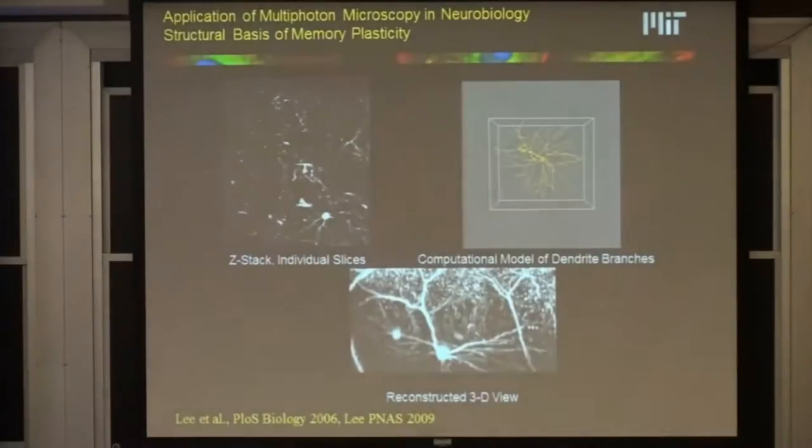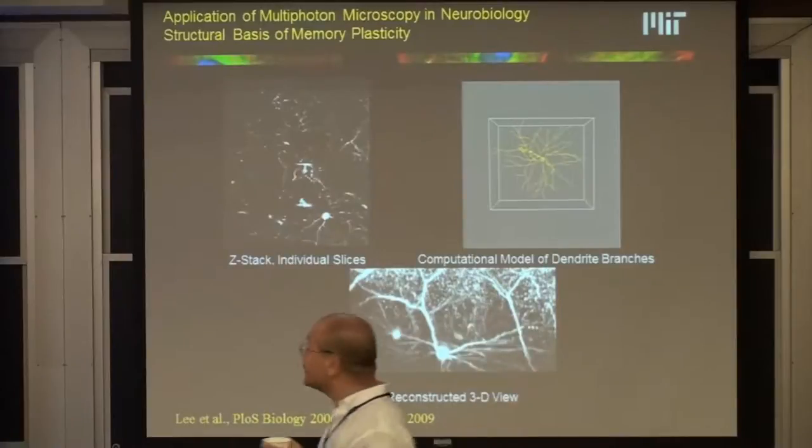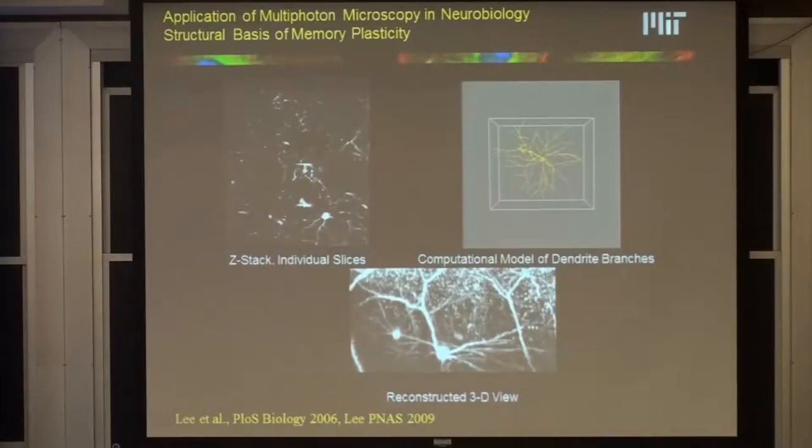Okay, so last image, so that I don't take up the panel's time, is if you take a look at what you can image with endogenous signal, that works pretty well. But I should point out that if endogenous signal works very well, if you express GFP and put in exogenous signals, you can certainly do better. So this is something that we do very routinely today. Many of you guys would be in Ali's lab this afternoon or tomorrow. We image through the head of the mouse by putting a window on the skull, actually two windows on the skull, and that allows us to image into the brain and look at GFP expressing neurons.